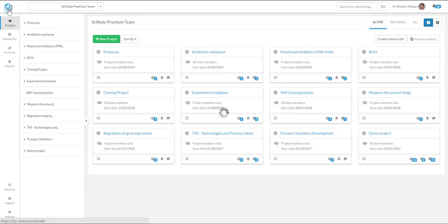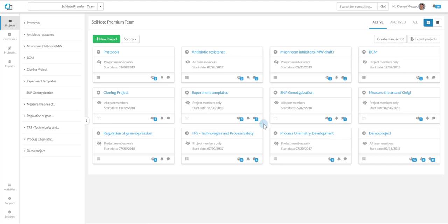Once your data is organized in SciNote by projects, experiments, and tasks, Manuscript Writer will enable you to generate a draft of your manuscript.